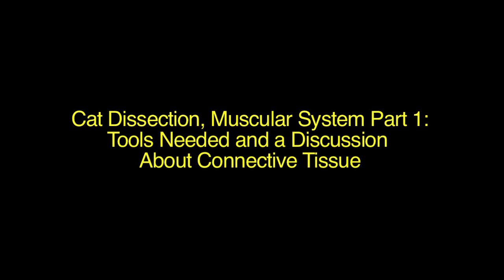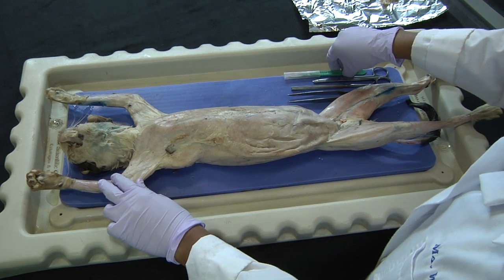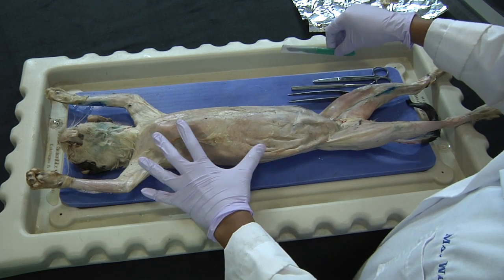Today we are going to conduct a cat dissection. The goal is to isolate the muscles in the cat.